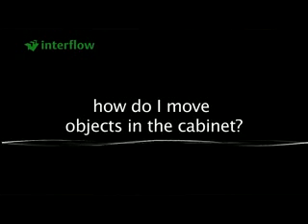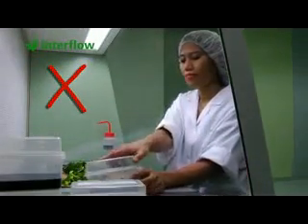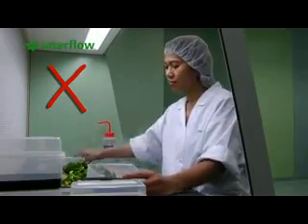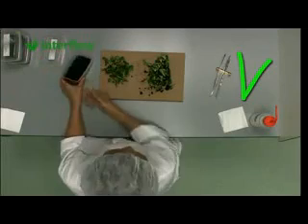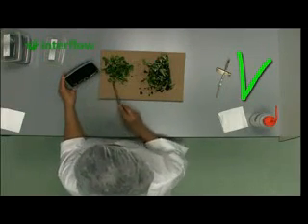How do I move objects in the cabinet? It is not good to move objects across each other in the working area, as this seriously disturbs the air flow. After picking the objects up, it is better to place them back in the same place. This also applies to the tools.